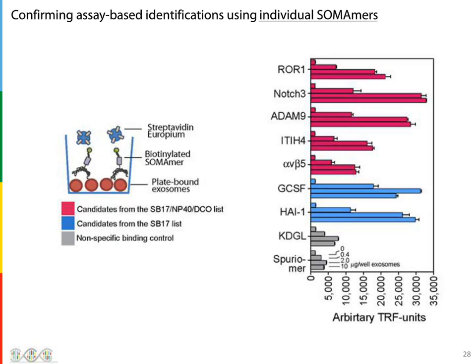It was the first time I'd had hands on these reagents, and I had only a couple of days to do this. Nevertheless, to see positive hits here, this gives signal that was dependent on exosome dose, was again reassuring that these were real IDs that we were seeing.